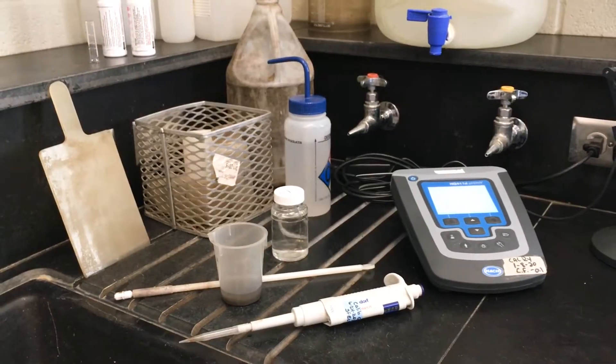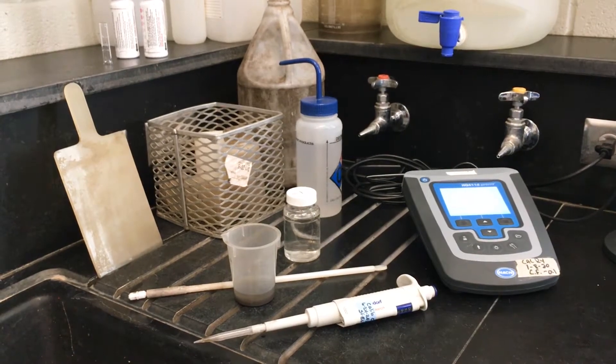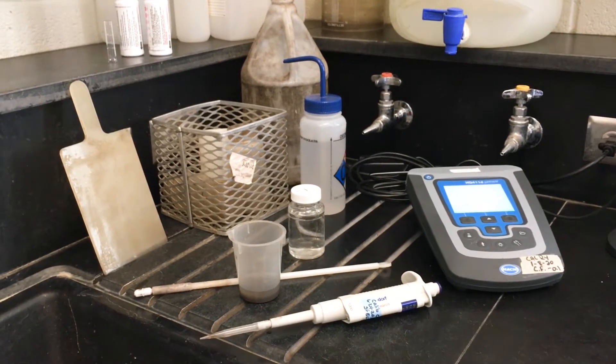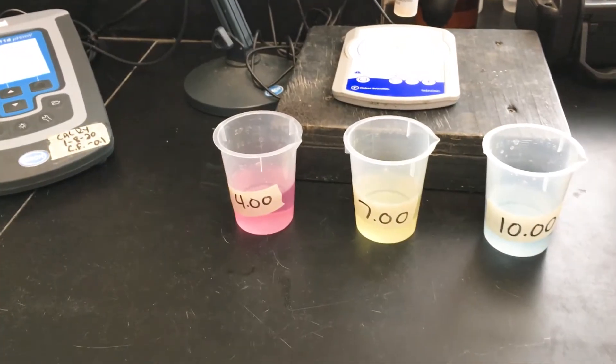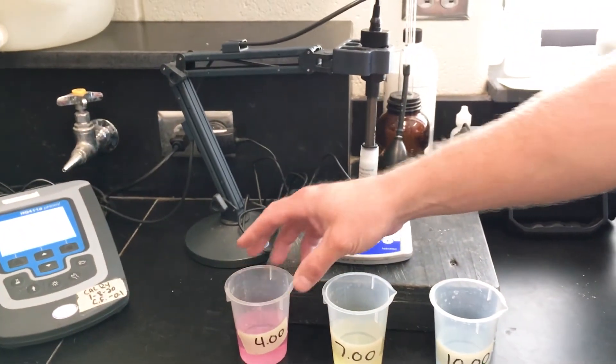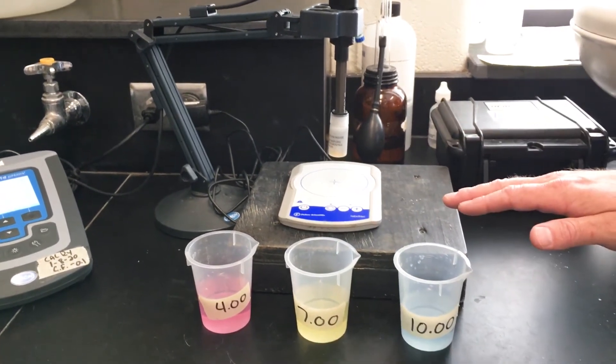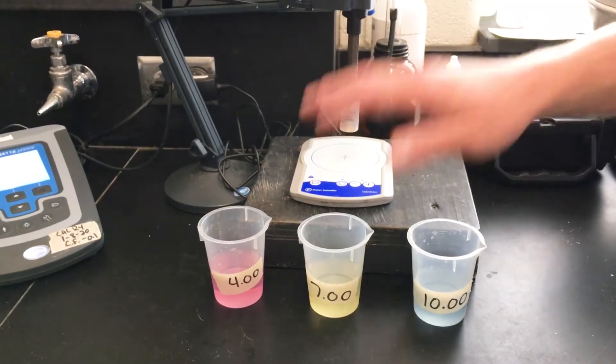This is the pH meter. pH stands for power of hydrogen and it tests how acidic or how basic the water is. These are our buffers. To make sure that this pH meter is calibrated correctly, you need to test it at a 4, 7, and 10 range to make sure that they're all correct.